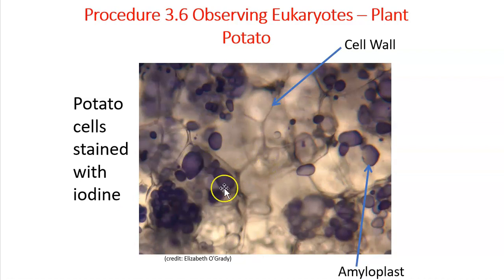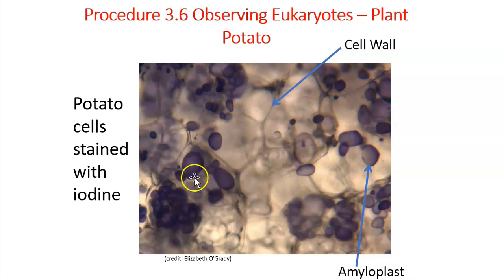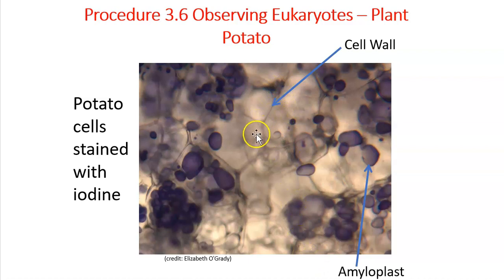We see these little purple structures. Those purple structures are a special type of plastid called an amyloplast. Remember, plastids are special organelles that ultimately are going to store things like carbohydrates. Chloroplasts are a plastid, and amyloplasts are also a plastid. These amyloplasts are going to store large amounts of starch. The potato is primarily the energy storage part of the plant. You can see that there are lots and lots of these little amyloplasts within each cell, with each cell separated by a translucent line — the plant's cell wall.